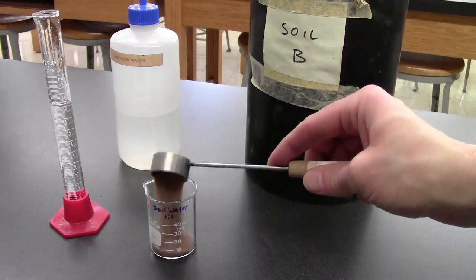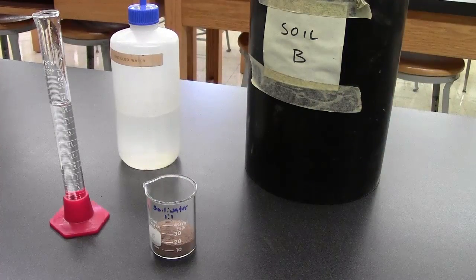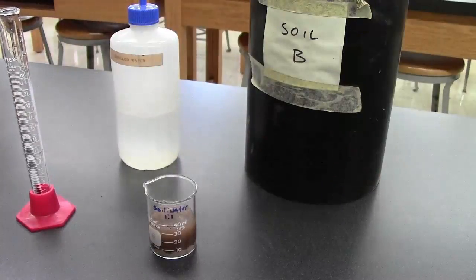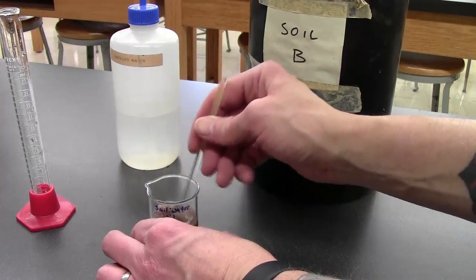To demonstrate active acidity, we'll mix 1 part soil with 1 part water. We can use a 10-gram scoop rather than weighing the soil on a scale. 20 grams of soil goes into the beaker along with 20 milliliters of water. We stir the solution and allow it to sit for 10 minutes.